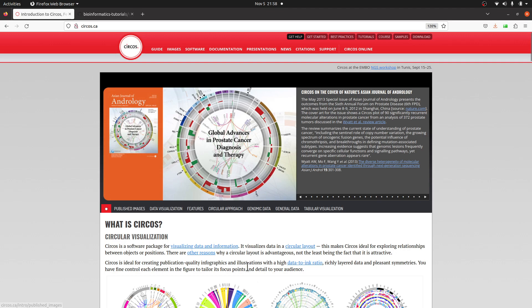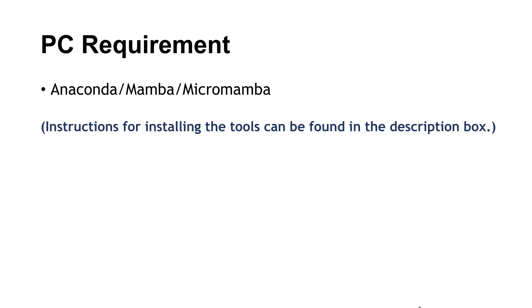We are going to install using Conda. So what you need to do is make sure you have Conda installed, or Mamba, or MicroMamba — any of these tools is fine. You can install either Anaconda, Mamba, or MicroMamba; any of them can be used to install Circos. This is the only requirement you need, and of course you need to have a Linux or Unix-like software system.